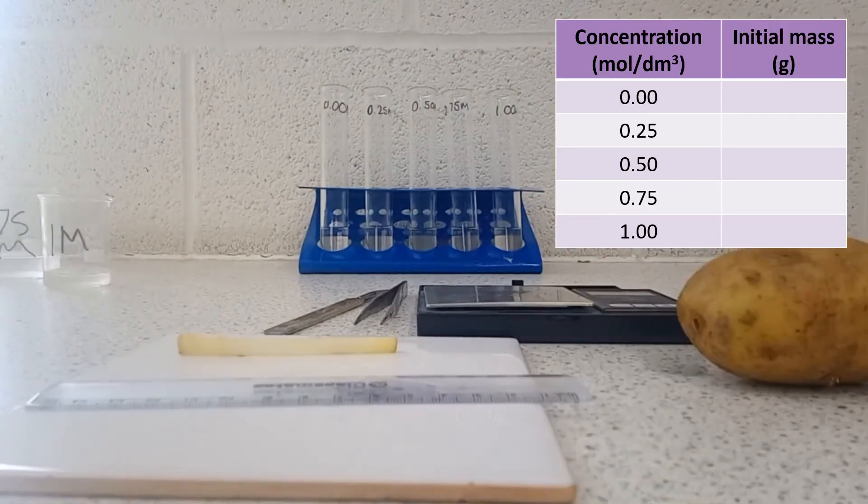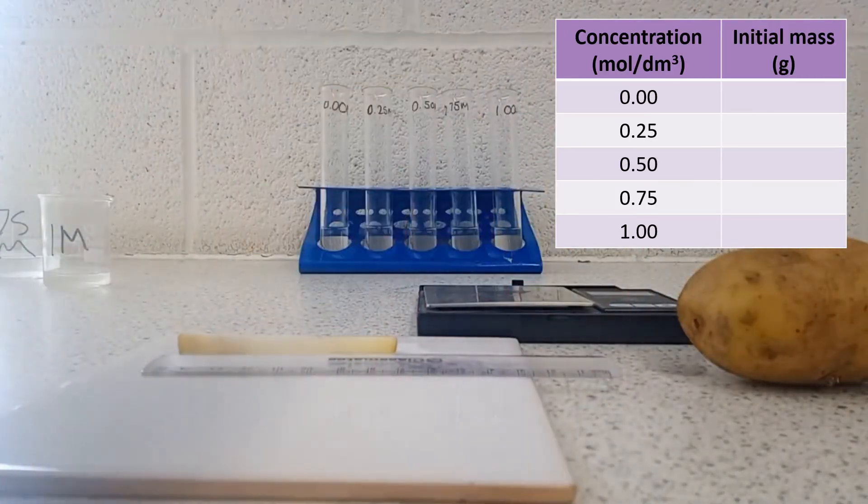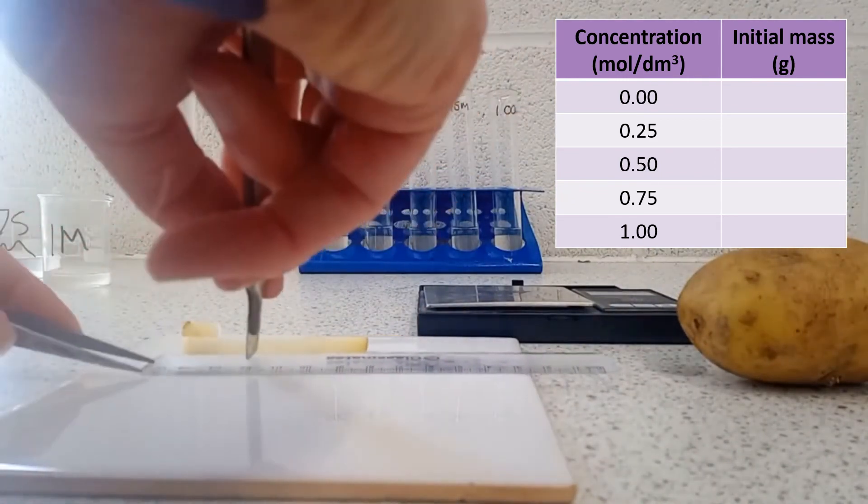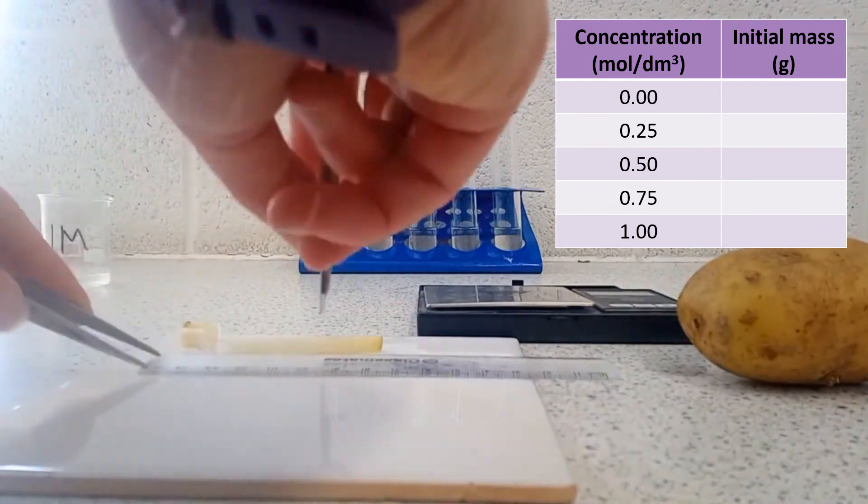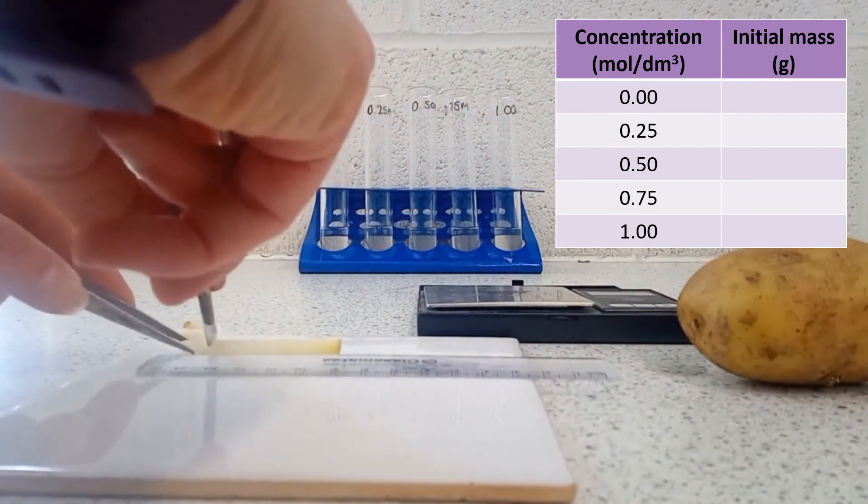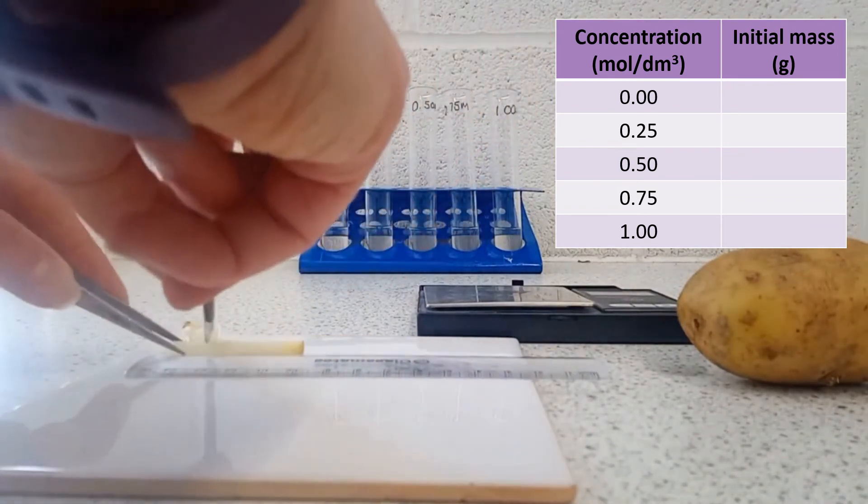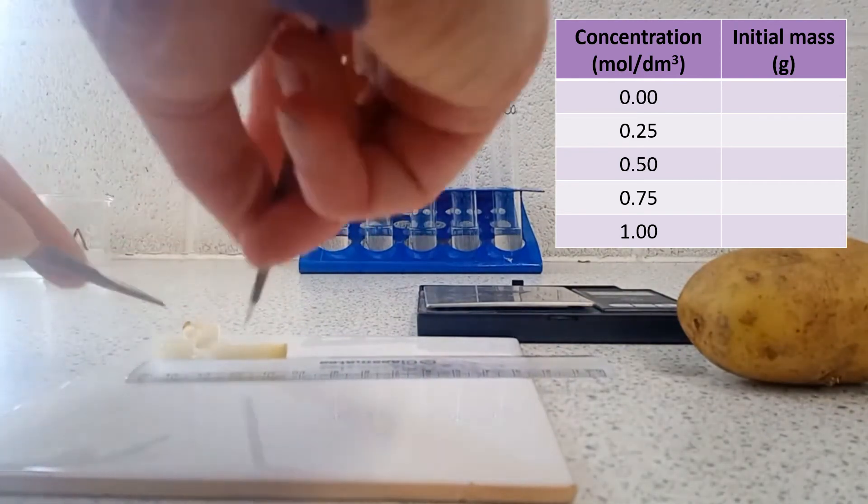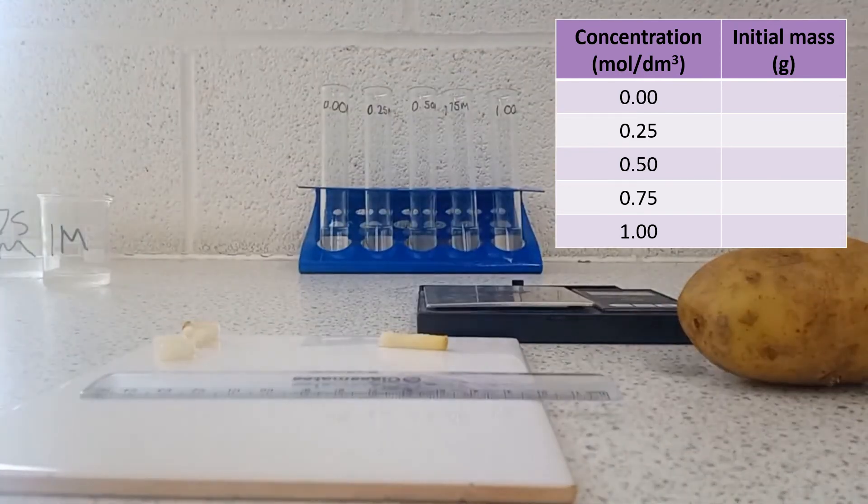I now use a ruler, forceps, and a scalpel to cut five 10mm pieces of potato to go into the five solutions. I measure the mass of each one using the balance, and this is important because even using the borer and the ruler, my pieces aren't actually identically sized. So I need to know what the mass is at the start so that I can work out the percentage change in mass.